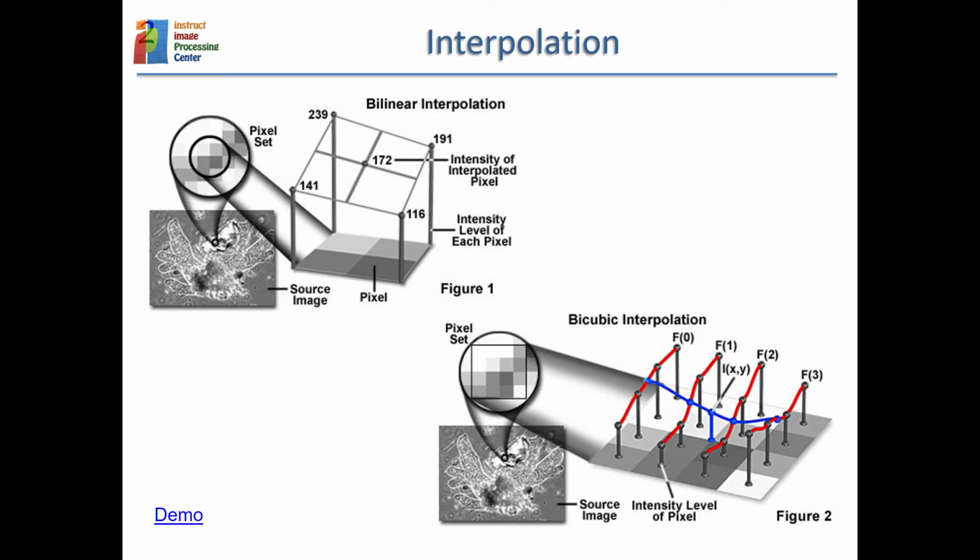You can go as far as you like, and the farther you go, the more complex your continuous function will be. And for instance, if you take 16 values around, it is called the bicubic interpolation, bicubic because in each direction you have a cubic polynomial. Here it is called the bilinear interpolation, because with this plane, in each direction what you have is a line.